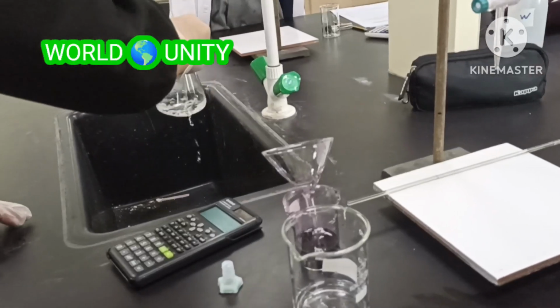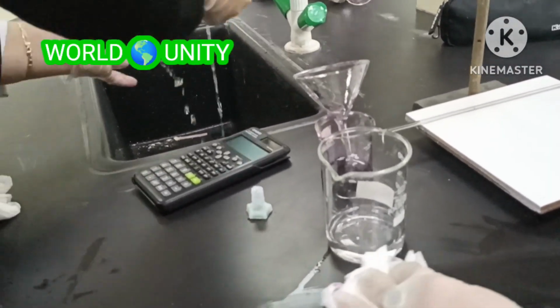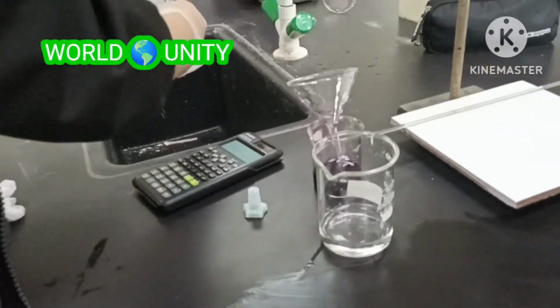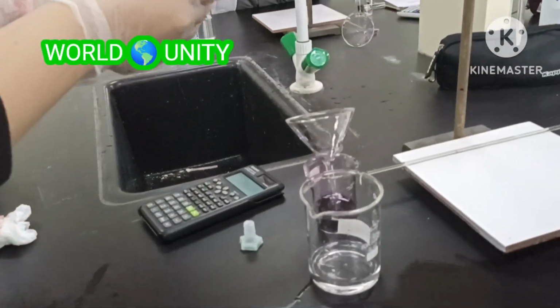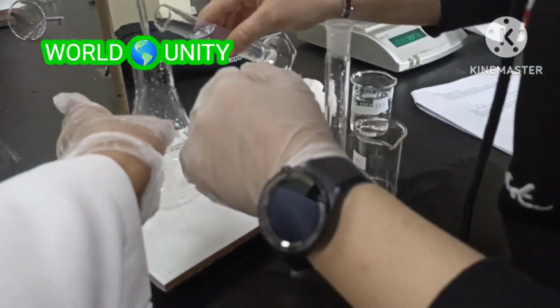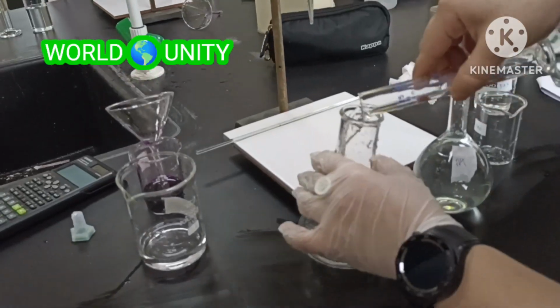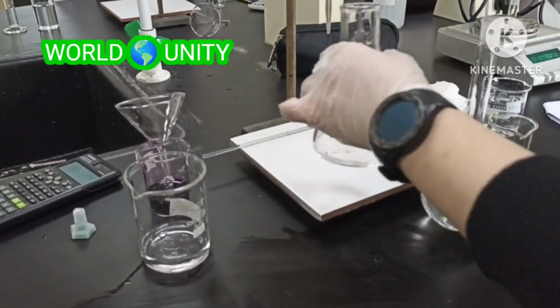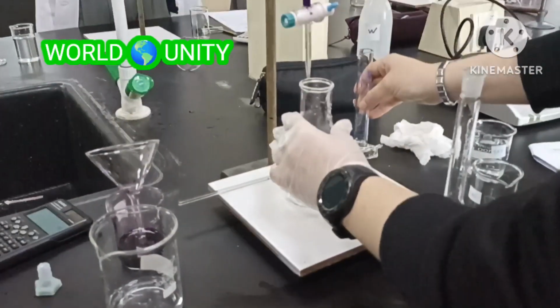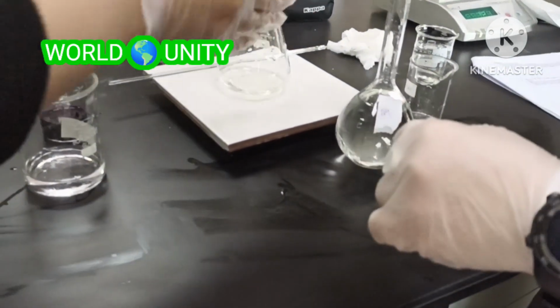Guys, keep your station clean. Never forget that. No, don't say that because it's very dangerous. Yeah, no. Now put it in here. Put it in here. Then next, you rinse that again. Rinse this. You should rinse this.